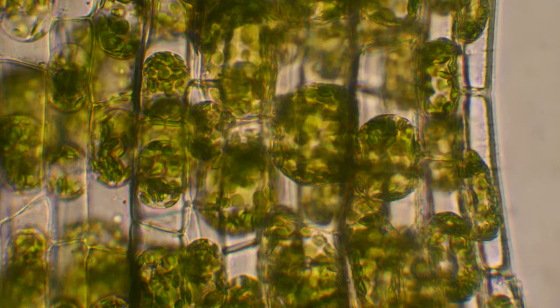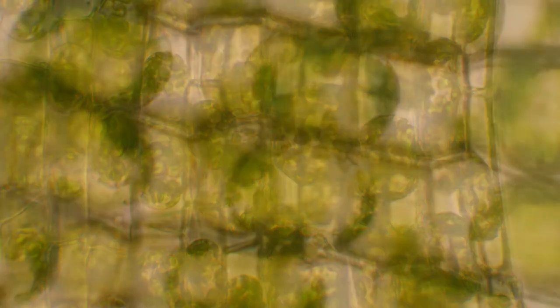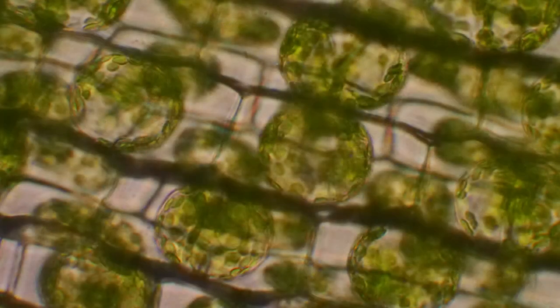What is going on here? You can still see the cell walls and they're holding their shapes, but now you can also make out the cell membrane, which is this flexible sort of skin that a cell has. Cell membranes work to control what comes in — like food — and what goes out — like waste products — but the cell membrane can't control the flow of water in or out. If something is pulling water out of the cells, the cell membrane can't stop it, and if something is pushing water into the cells, the cell membrane can't stop that either.